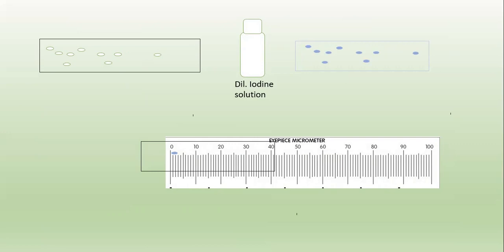Once we have stained the starch grains, consider a single starch grain and adjust the eyepiece micrometer so that the starting of the starch grain coincides with the eyepiece micrometer. The starting line is to be aligned with the starting of the starch grain. Count how many lines are there within the starch grain — we find one, two, three. These are three lines.